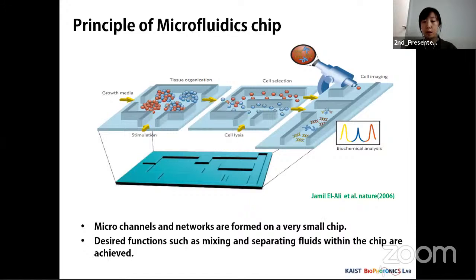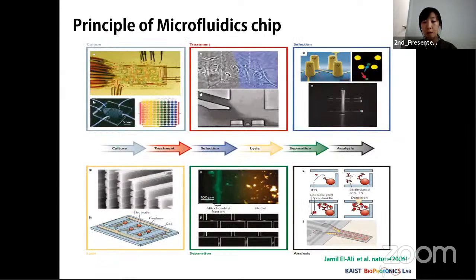Microfluidic chips are made using microfluidics. These chips are networked inside the small chip. In addition, it is possible to implement all the procedures according to the composition inside the chip. In general, it is possible to implement all the actions involved in sample analysis inside the microfluidic chips.